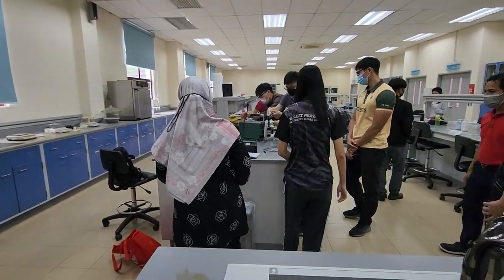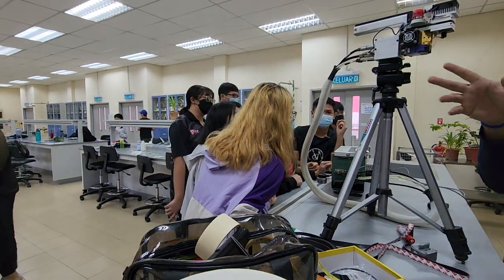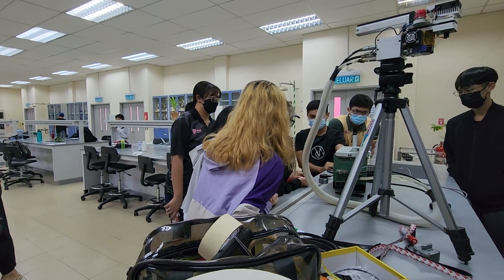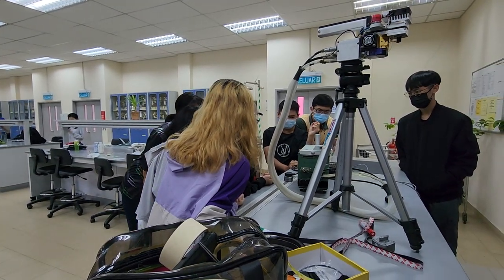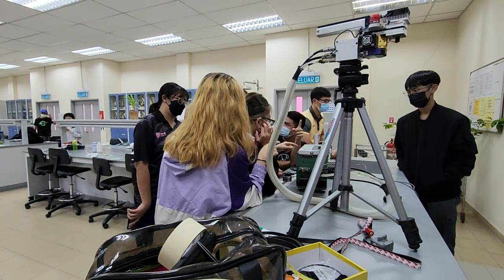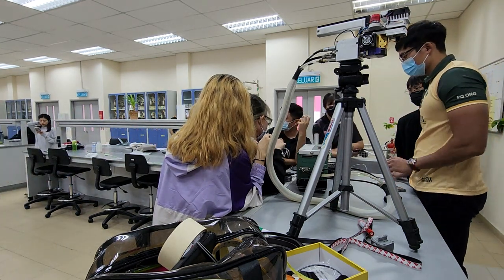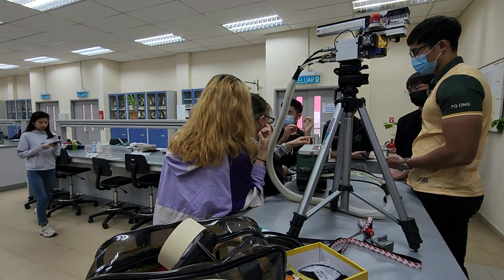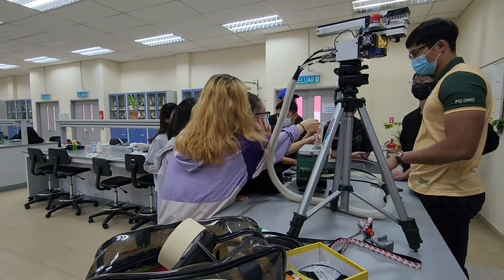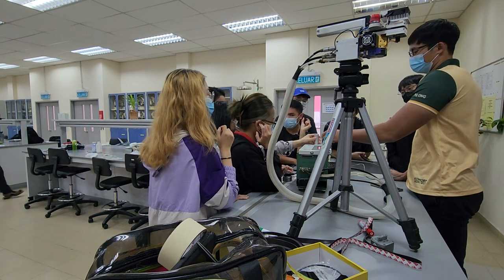We pass through all of this, then it goes through that reading. So let them finish first, and we will start. The extra carbon dioxide scrub. This is carbon dioxide scrub. This is water scrub, H2O. The sensor head senses carbon dioxide, CO2, H2O, many things, then it passes the signal back to this console. The console does the calculation; it has an equation inside.